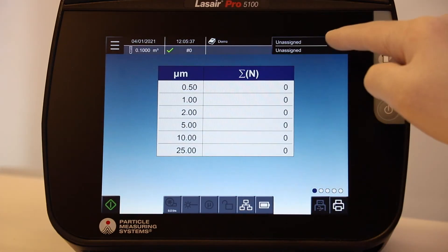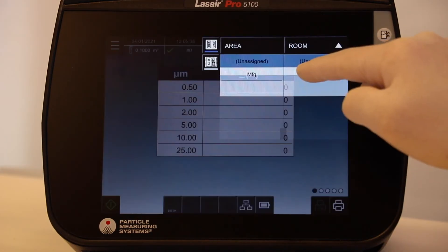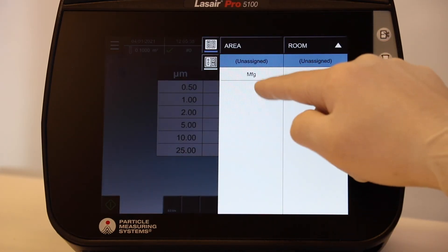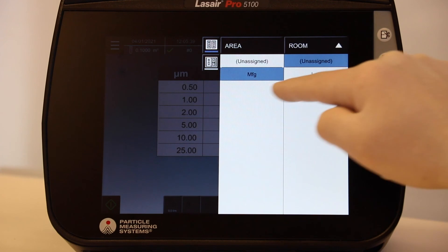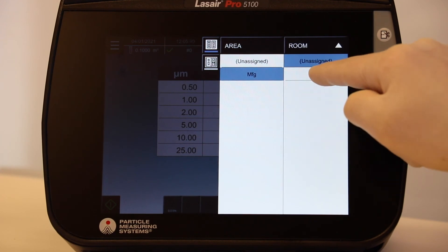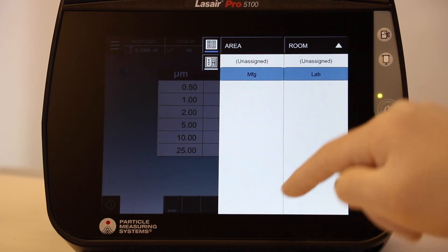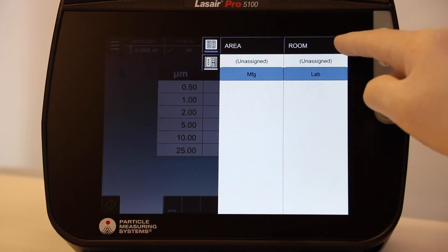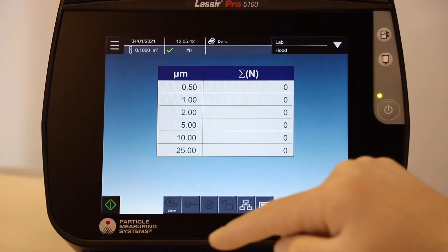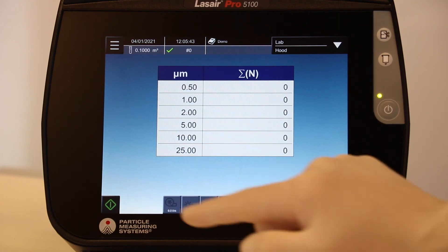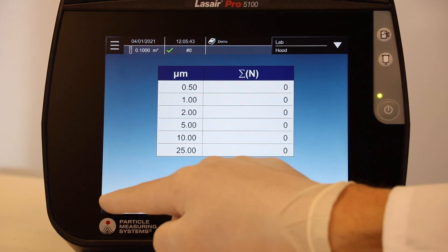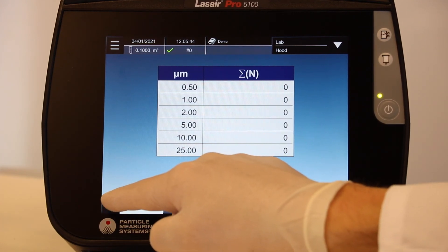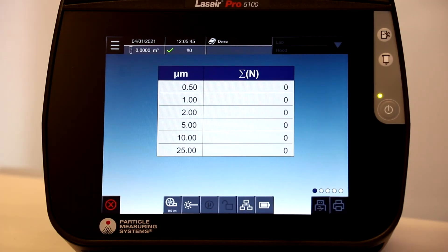Here you can simply select the location you wish to sample in the upper right corner with the drop-down, and select the area, room, and location and load them. The recipe for the location is now ready to run. Simply press the start sampling button.